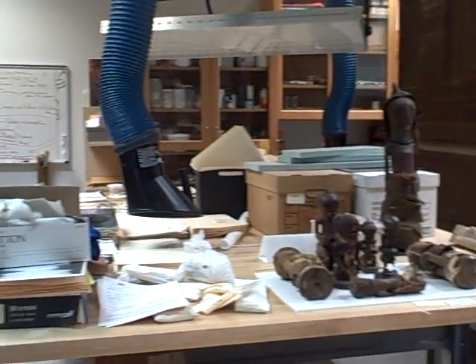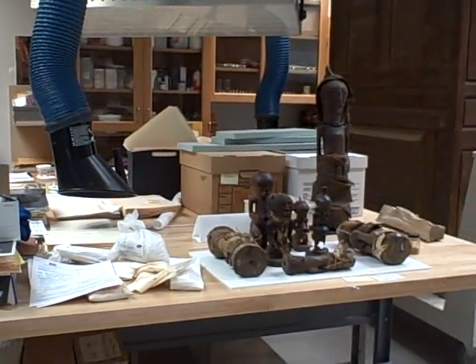Radiography is akin to what happens when you go in for a medical x-ray. Mm-hmm. We'll see the instrument here in a minute, but it uses x-rays from an x-ray tube and film to record the x-rays, and the object is placed between those, and if the object has radio opaque material, they block the x-rays. If it has radio transparent material, the x-rays go through. And so you end up with an image just like a medical x-ray, and that tells us something about internal structure, because a lot of these materials transmit x-rays.